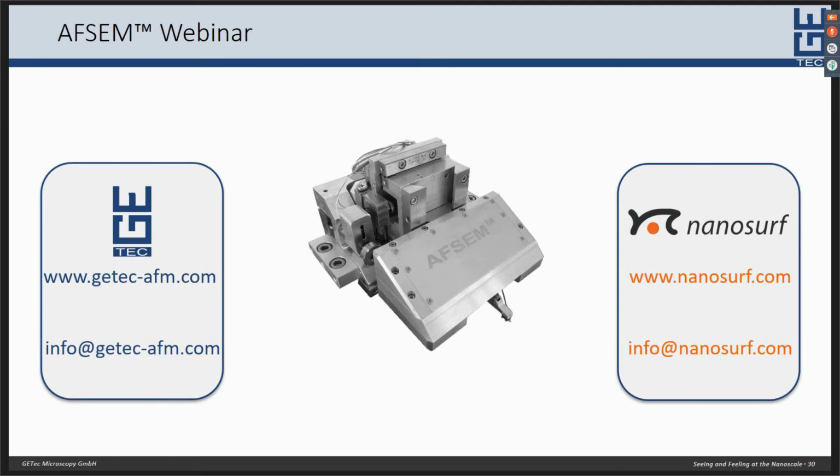The next question that was posted is, why is AFM considered as a non-destructive technique? Could the probe damage the sample? This pretty much depends on the user. So in principle, AFM can be considered as non-destructive as the tip-sample interaction strength or interaction force, for example in AC or dynamic mode, is really, really low.